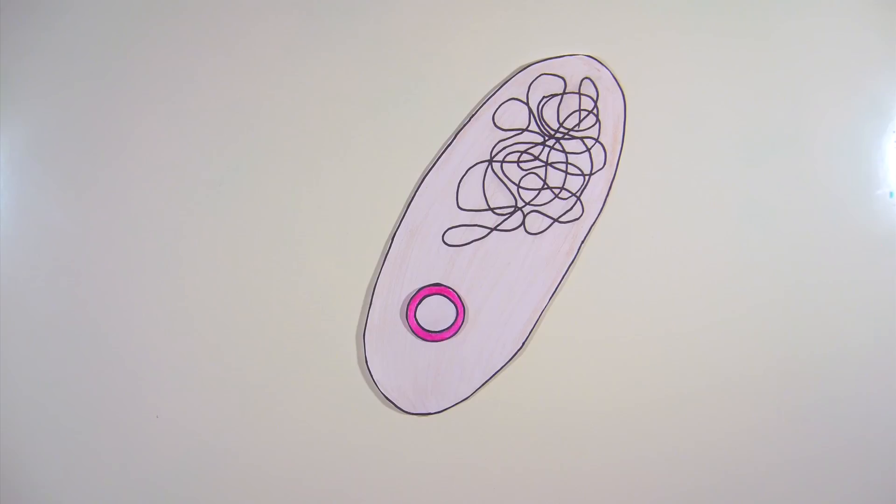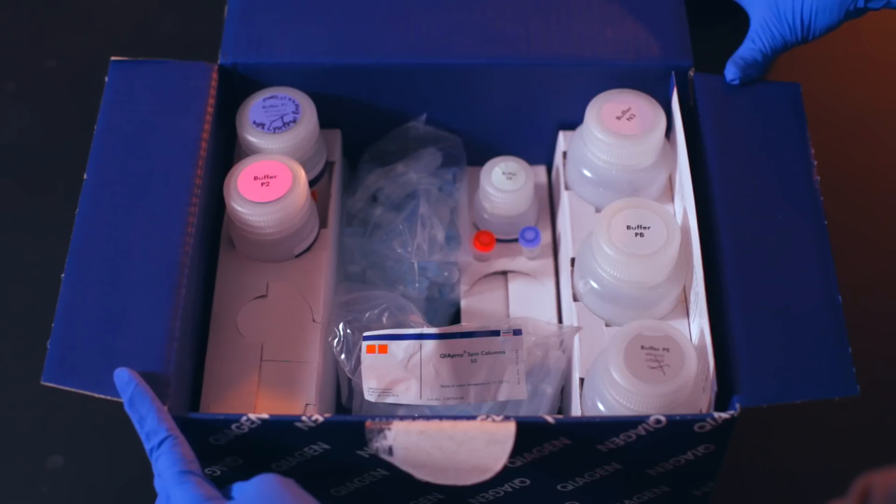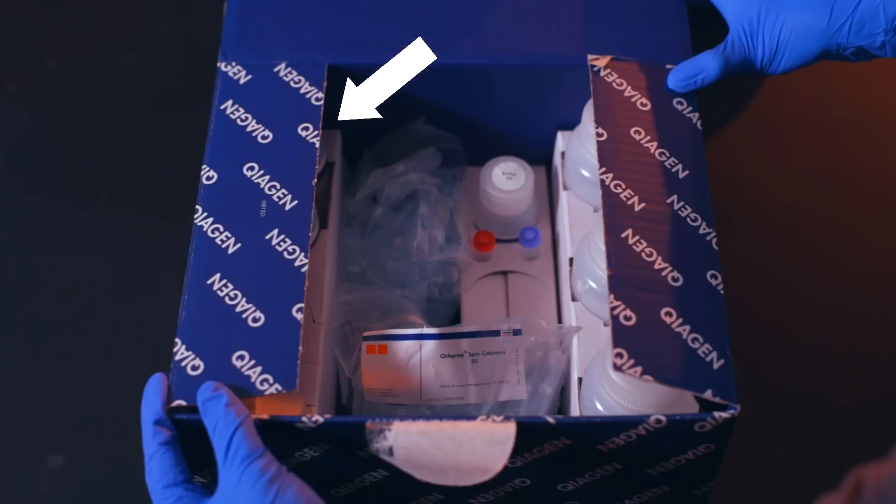In order to extract plasmid DNA from bacteria, biologists use a plasmid isolation kit, sometimes called a plasmid mini prep kit. This kit consists of a variety of buffers and a column that binds to the plasmid DNA to purify it.